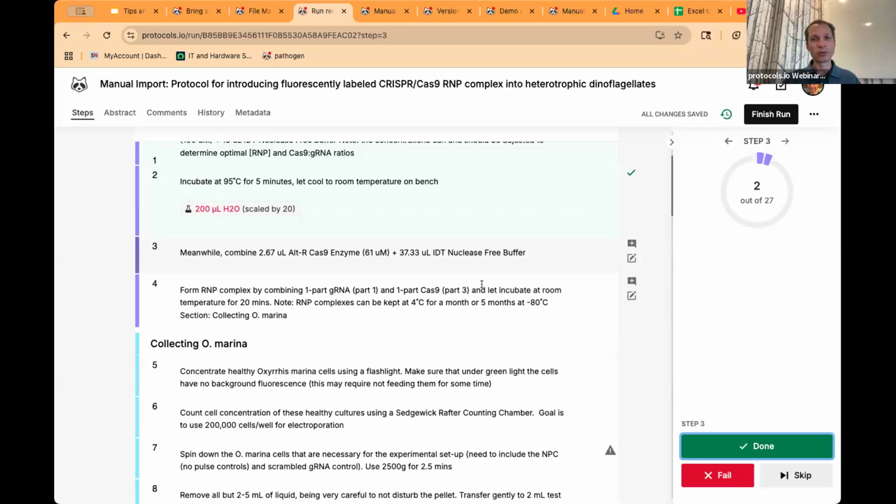And of course, it would be useful across different protocols. We don't have that now, but in the future, I can see that it would be helpful to know, did anything change today relative to how I usually run it, what to expect for this type of protocol. So I can see the benefit of that, but we don't have that right now.